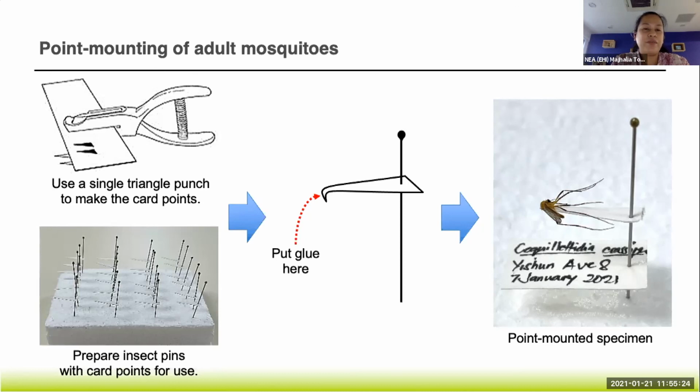If no freezer is available, we use sunlight. You can have your samples in styrofoam cups or paper cups, expose them to sunlight, and then as soon as they drop to the bottom of the container, you can start collecting them back. There are many ways to kill your mosquito, not just freezing, but of course, freezing will give you one of the better results.